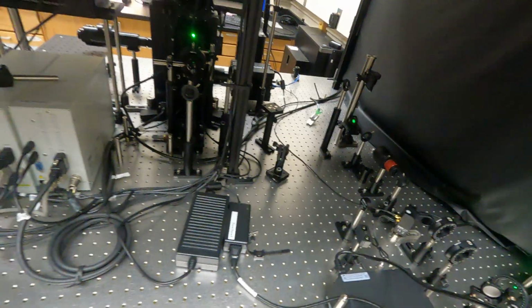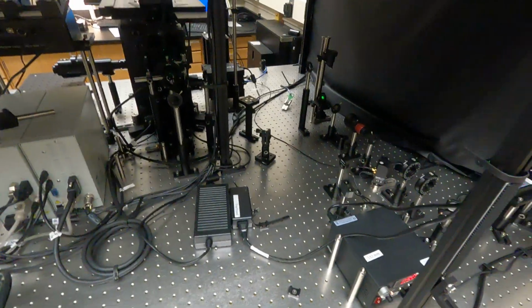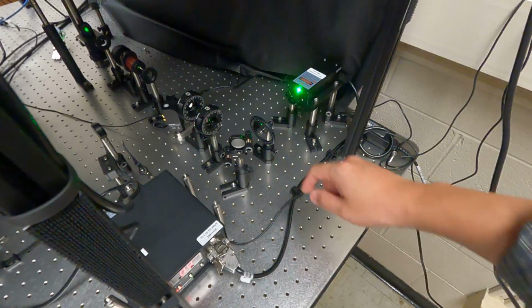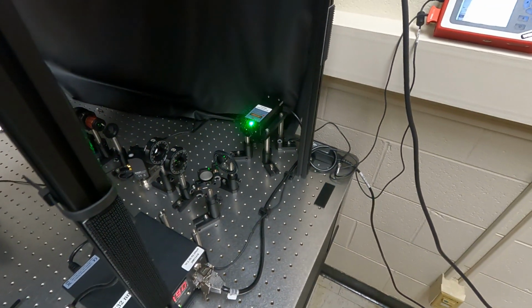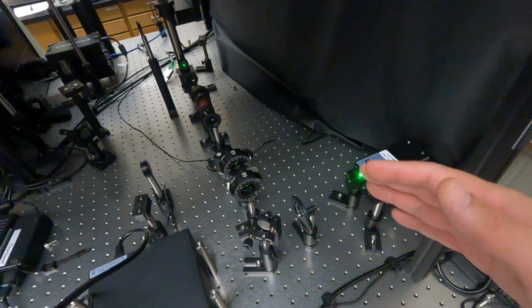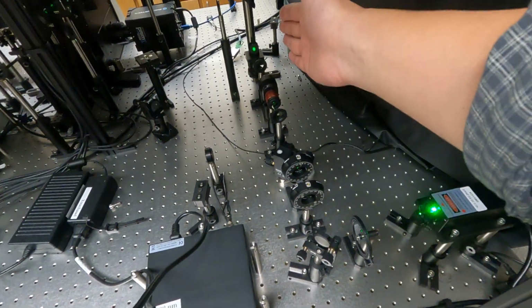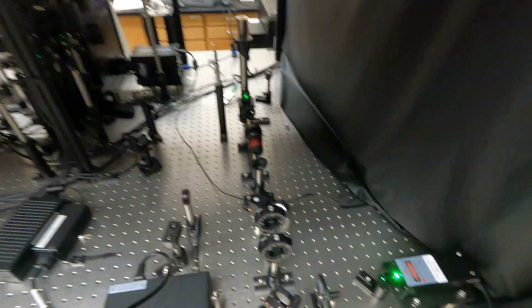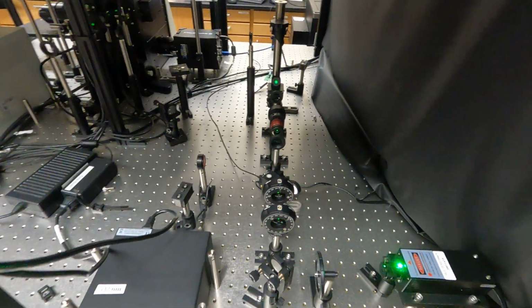For this laser excitation, this neutral density filter wheel is the only thing we'll ever touch. Try to avoid touching any of the optics along this line. Those are some of the essential components for the laser alignment.